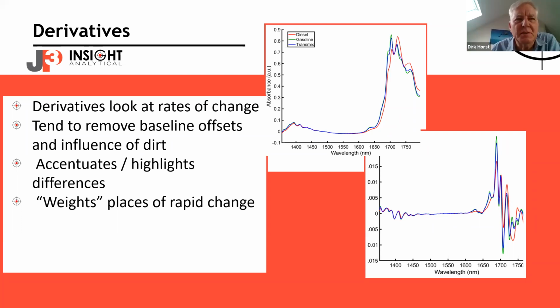So the accuracy depends on the model. How well have I built my model? How good was the lab I used? If I had a poor lab doing all my lab analysis, I'm going to build my model on those lab results. So again, we have to use a reputable lab, calibrated equipment, et cetera.